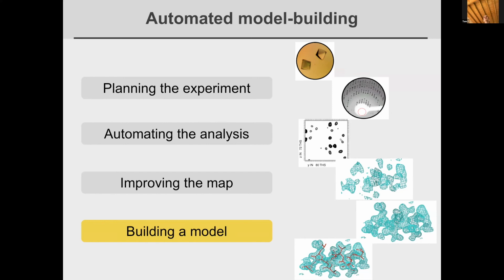So the way to handle that, the first cut of that, is just run it like normal. What'll happen is, even if you put in a sequence of something that's most similar, it should work reasonably well, but it won't be quite right. You have a couple options after that. One is if you don't put in a sequence, or it can't assign the sequence, what Autosol will do, or the auto building will do as well, is they'll try to put whatever residue fits the best in that location. So then you can fit things that way, and you'll get approximately the right answer.